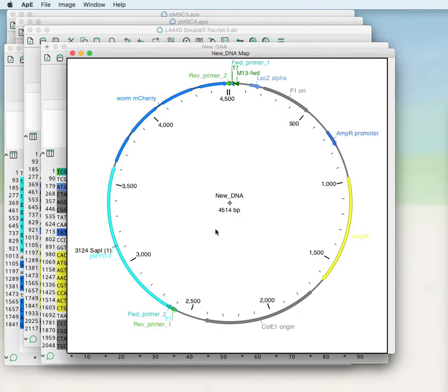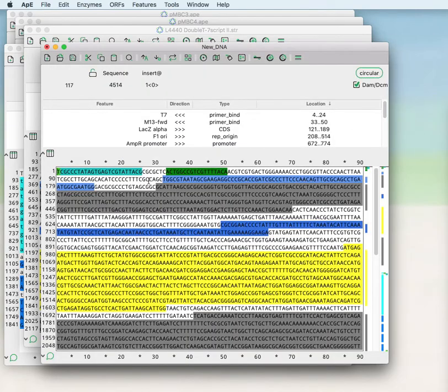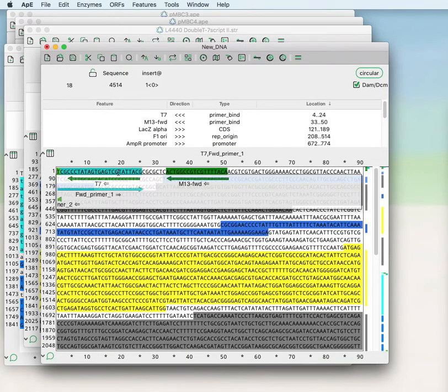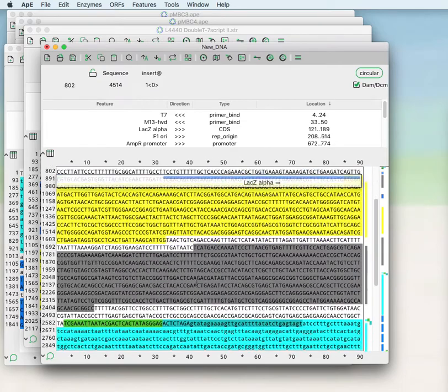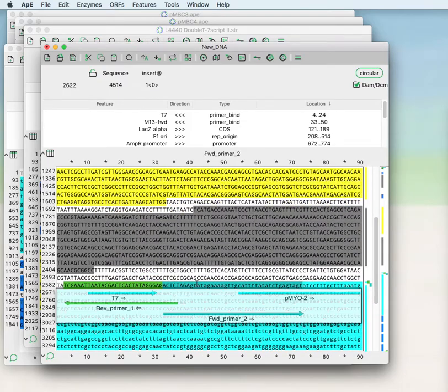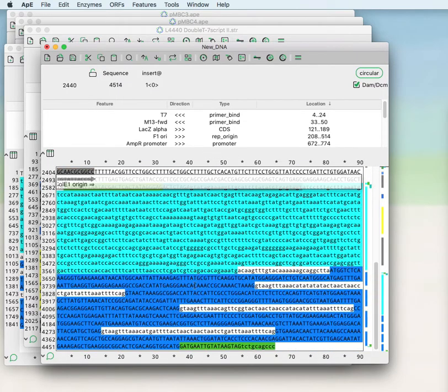We have Forward Primer 1, Reverse Primer 1, Forward Primer 2, and Reverse Primer 2. And if you use the x-ray window you can see the primers at each of the two junctions of the fragments.